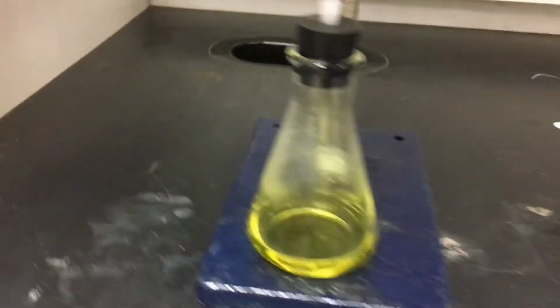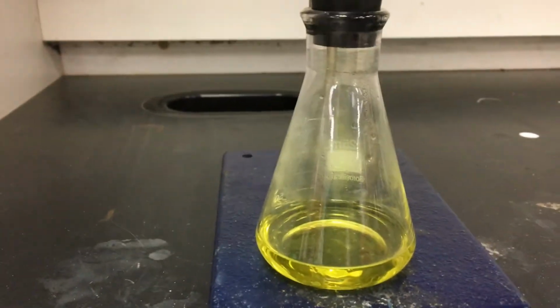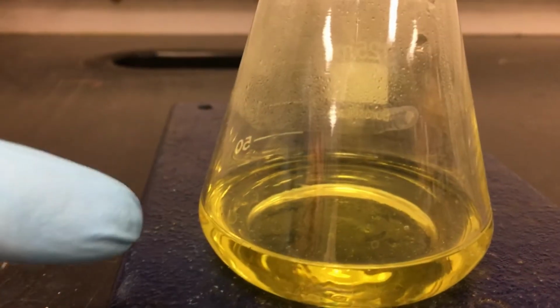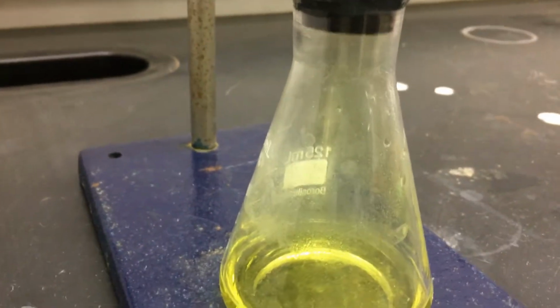Let's start with chlorine over here. Chlorine, Cl2, as a diatomic molecule, is a gas at room temperature. Now, it's kind of hard to see. The chlorine is actually above this liquid here. I'm using this liquid mixture of stuff to make the chlorine gas. But the gas itself is kind of a palish yellowish green.